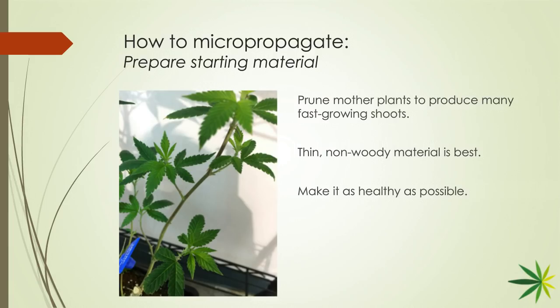All right. Well, I've given you a broad overview of all of the potential methods, but we're just going to focus on micropropagation, the one that I think is the most accessible to our audience, and one that people could consider beginning to use right away. Information you can use, I hope.